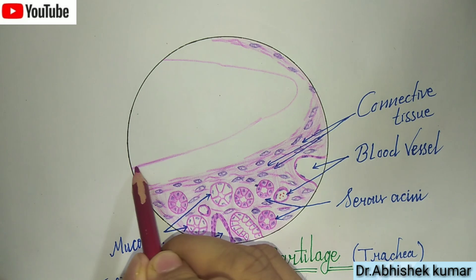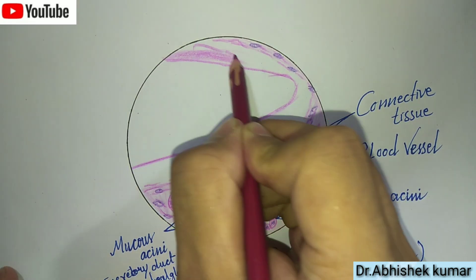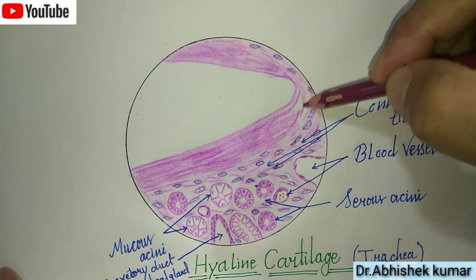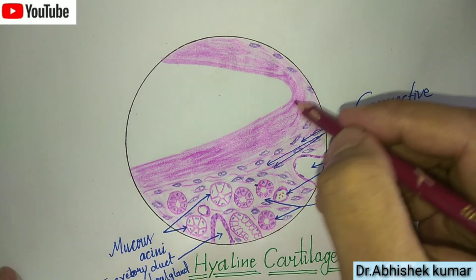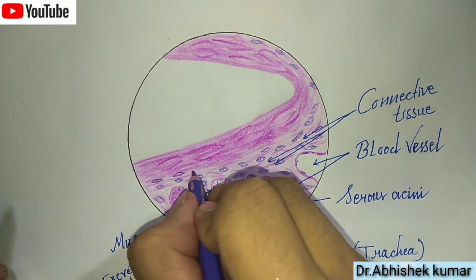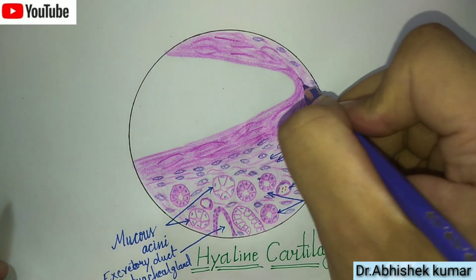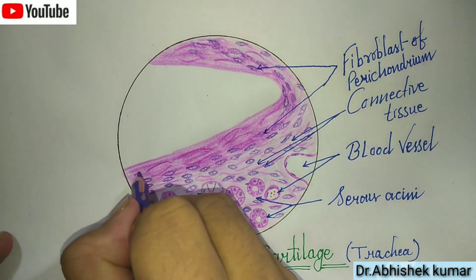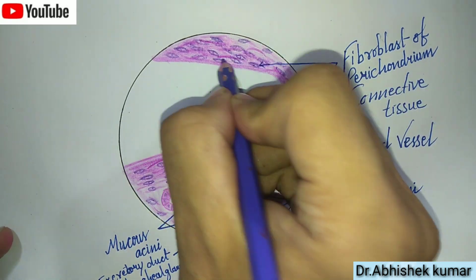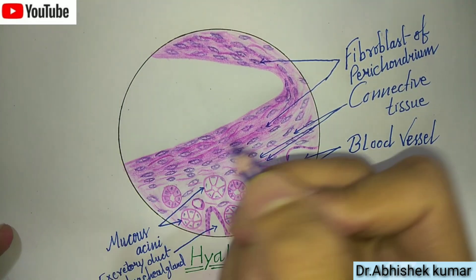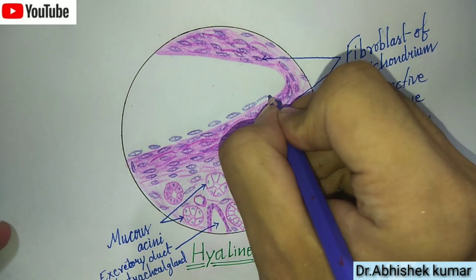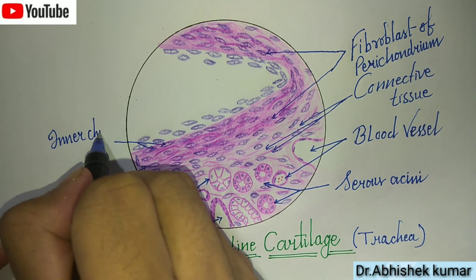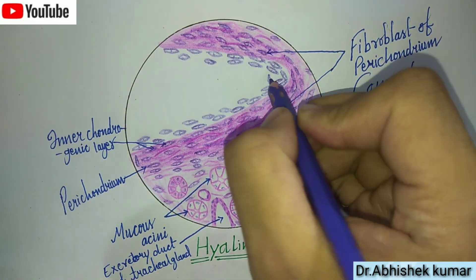Here we have the connective tissue, and here is the fibroblast of the perichondrium. This is the perichondrium, and here is the inner chondrogenic layer.